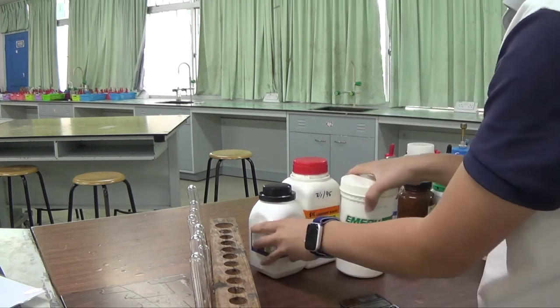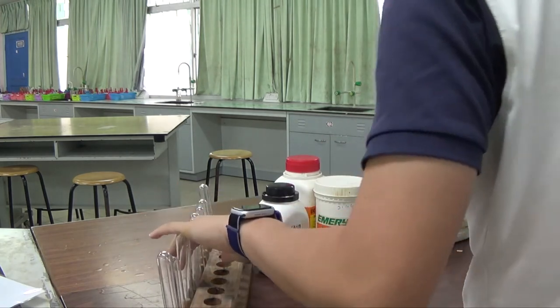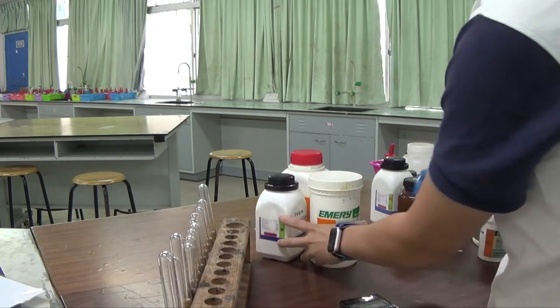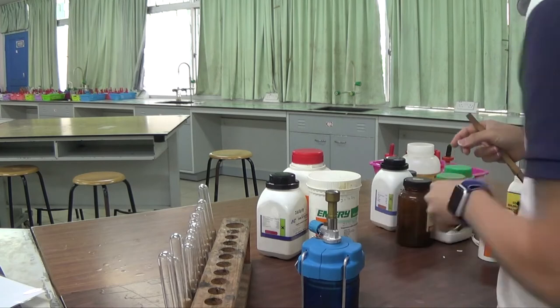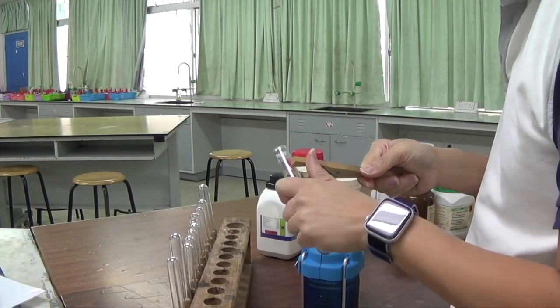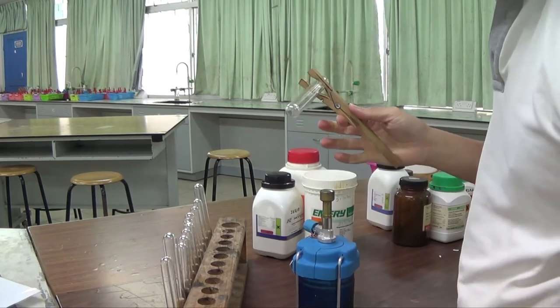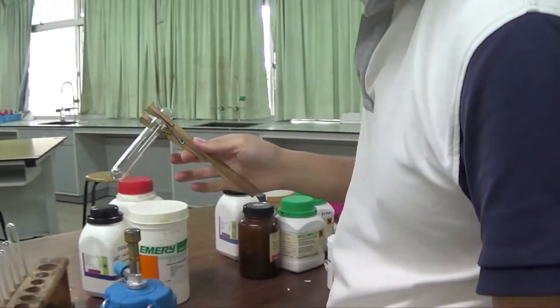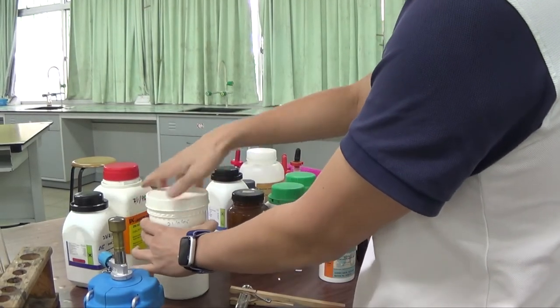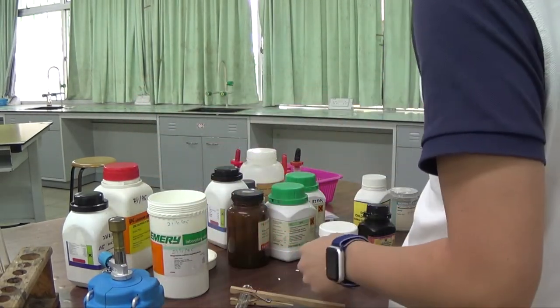Hydrated magnesium sulfate. Okay, so I have test tubes. By right, I should be heating in a boiling tube because a boiling tube can resist higher temperature. But I just want to show you what you will see when you have a white solid, and sometimes you are asked to heat it and make observations. All right, so you don't even know what solid it is.